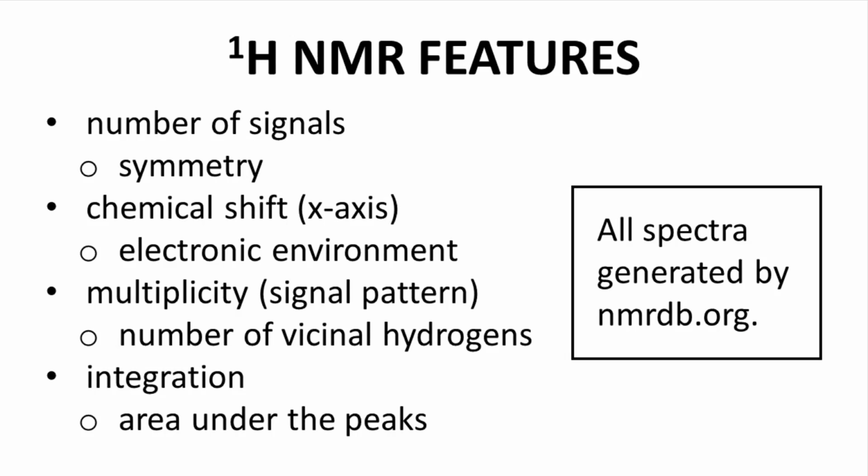Alright, as we work through these problems, I am not going to follow a specific set of steps. I tend to do these problems by feel. If you are looking for the best steps for interpreting spectra, then I don't have that. Hopefully, if you watch all these problems and solutions, you will see multiple different approaches to answering these questions. You can then rely more on a specific method if that one works better for you. Okay, let's go.